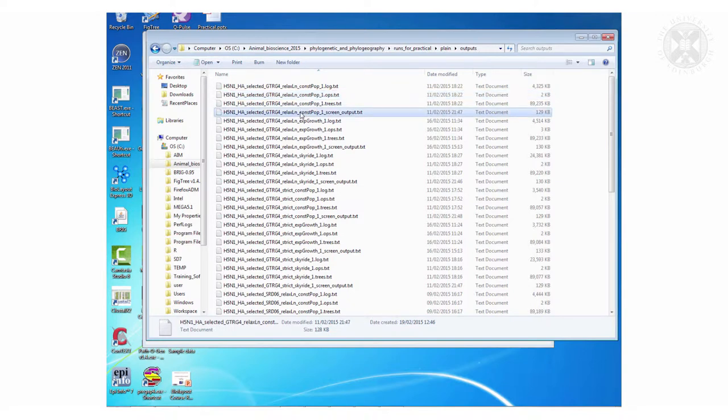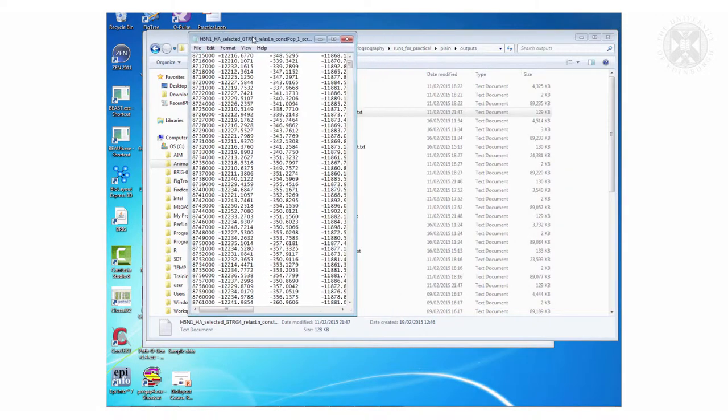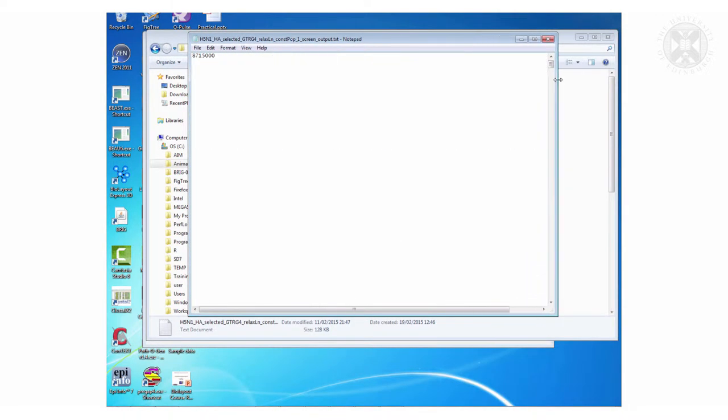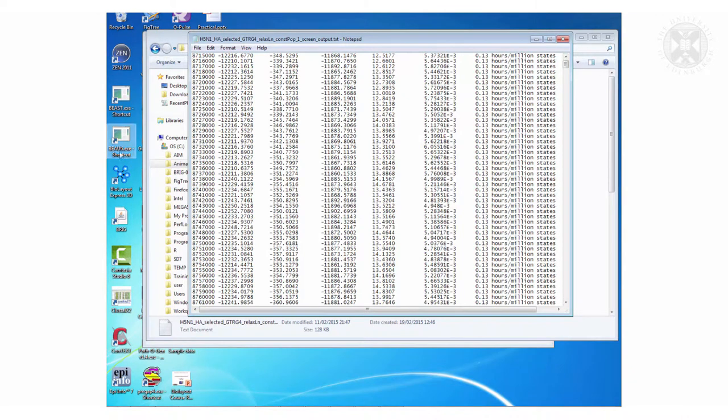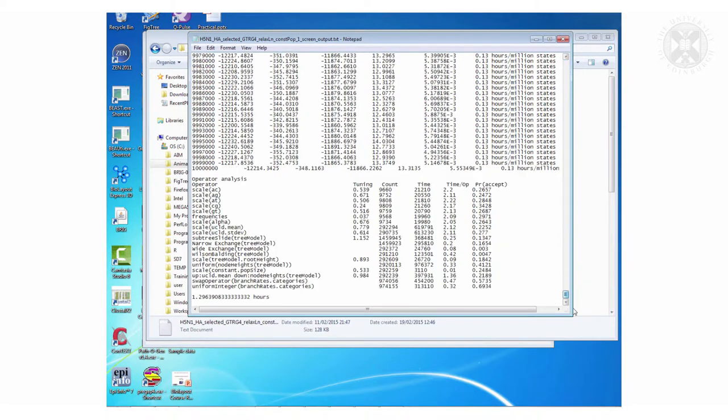The other thing though was I captured the final screen output. So when that thing was running it was saying at step whatever likelihood is this, how many hours per million states it was running. And at the end it tells you how long that run took.